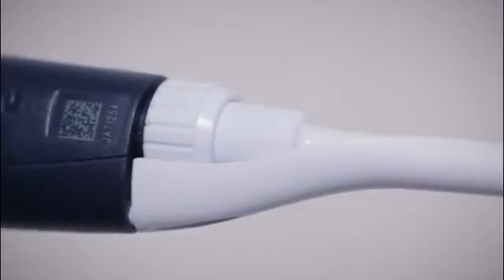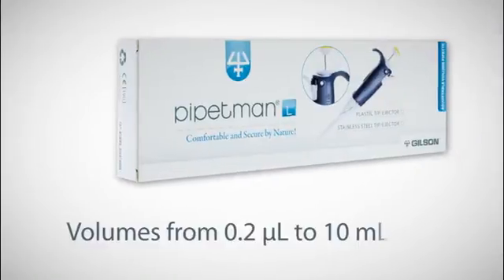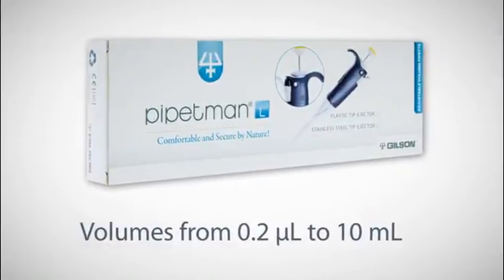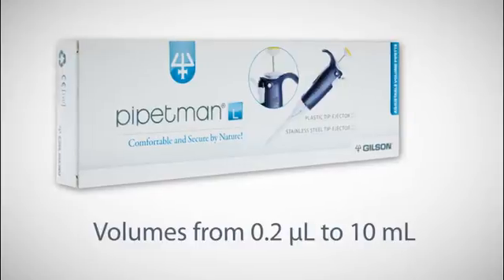The PipetMan L is available in eight models. You can either choose a pipette with a plastic or metal ejector.